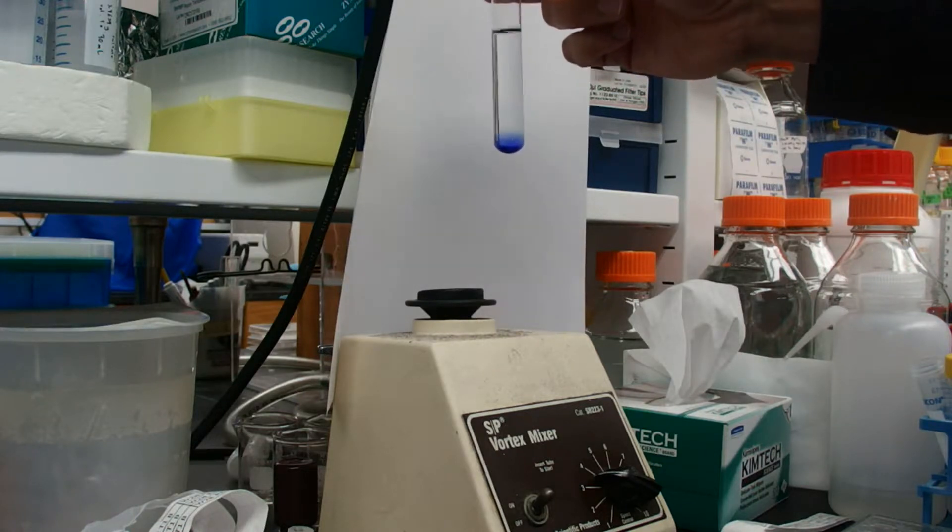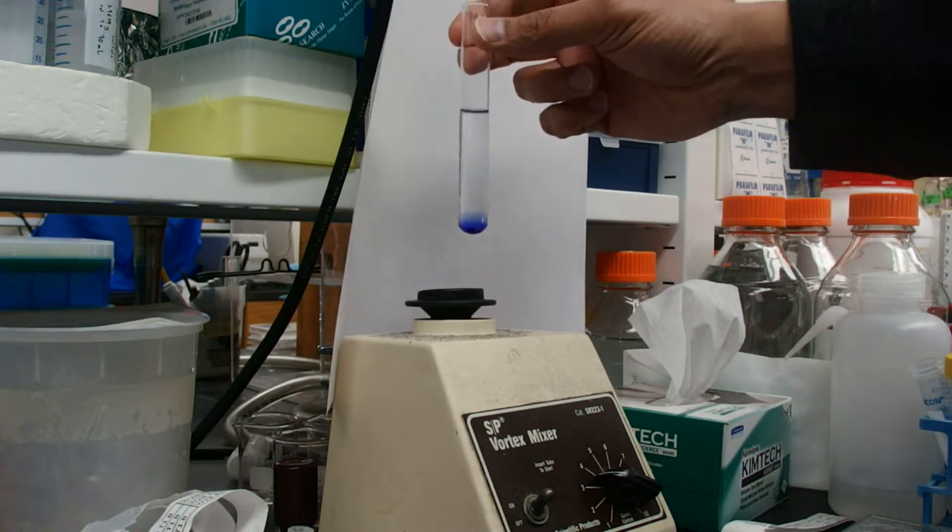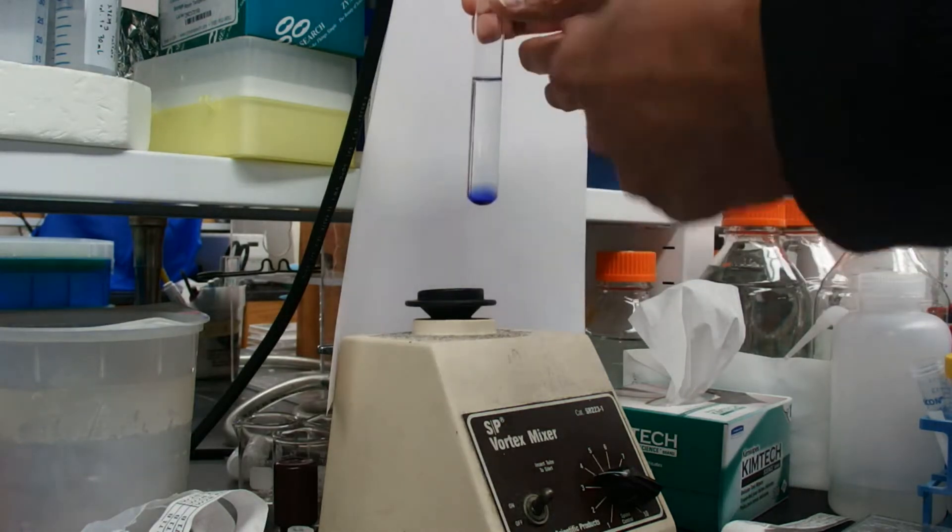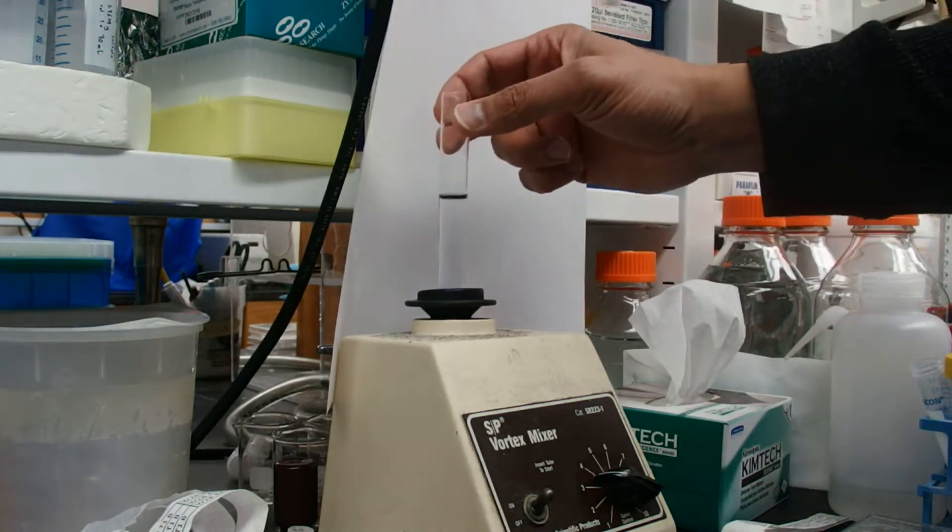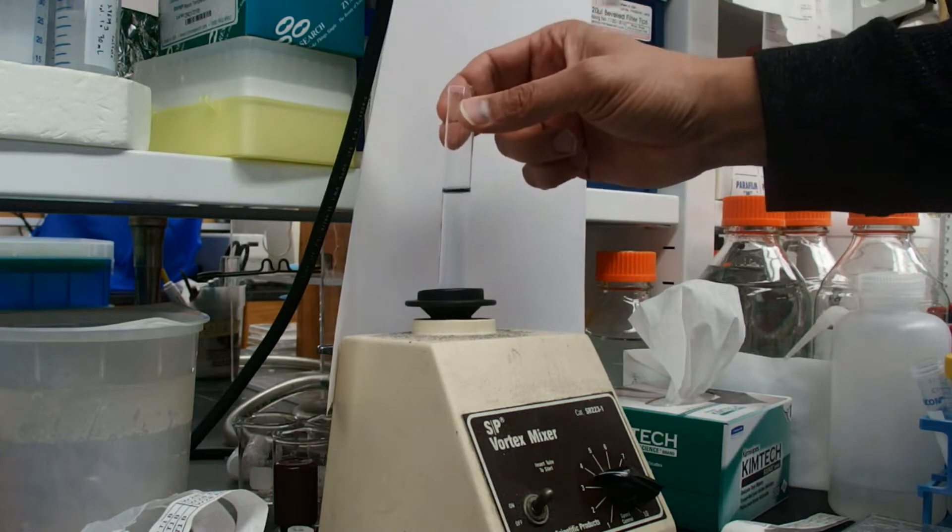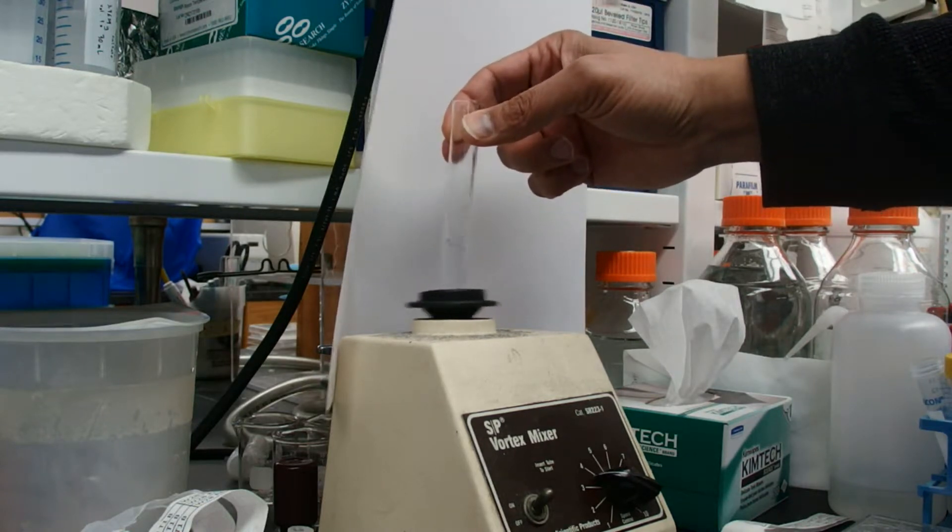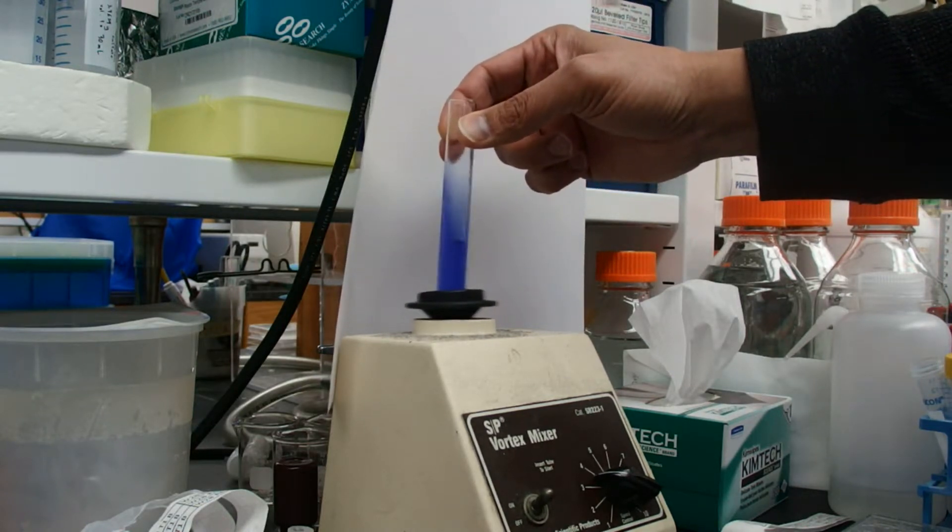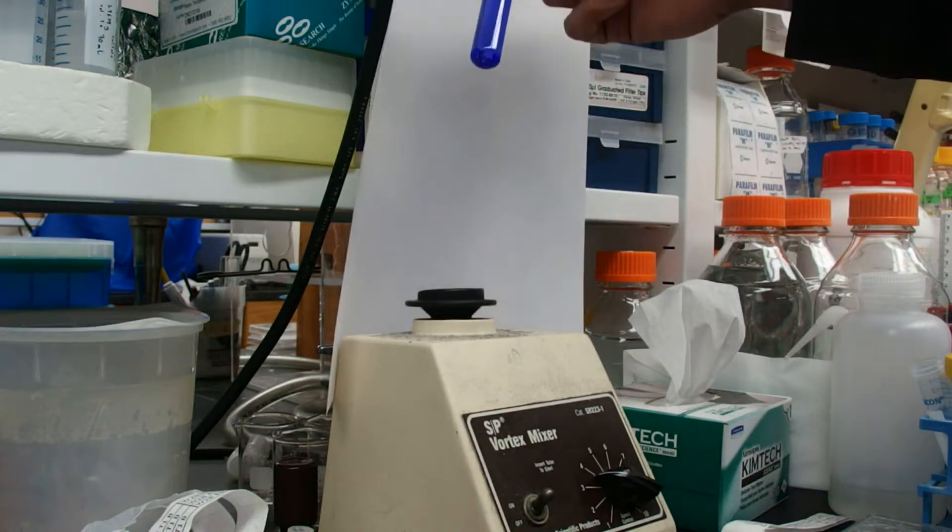We need to vortex a little bit harder, so that we get a swirling action around the inside of the tube, like this. And there you can see that now we have a very well-mixed solution.